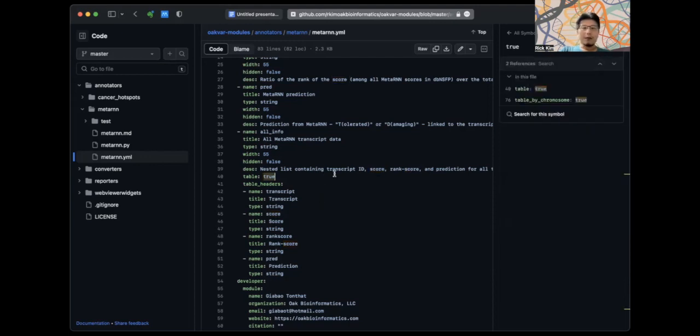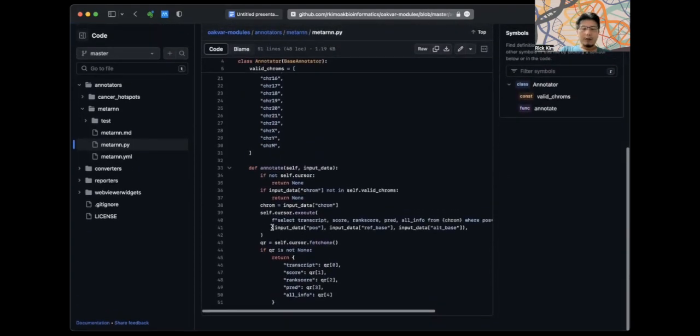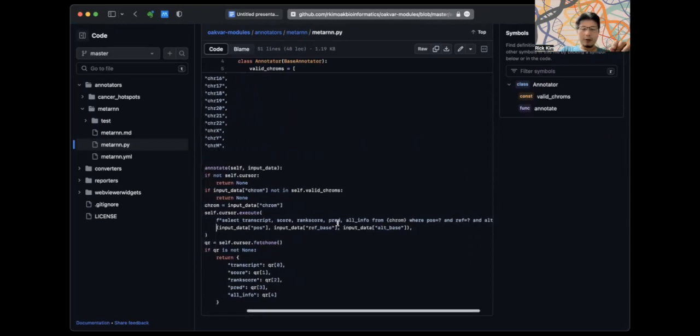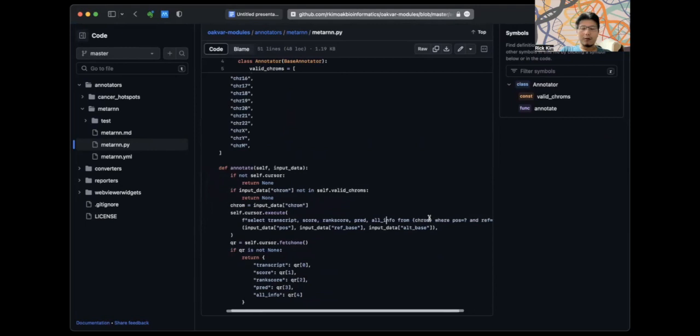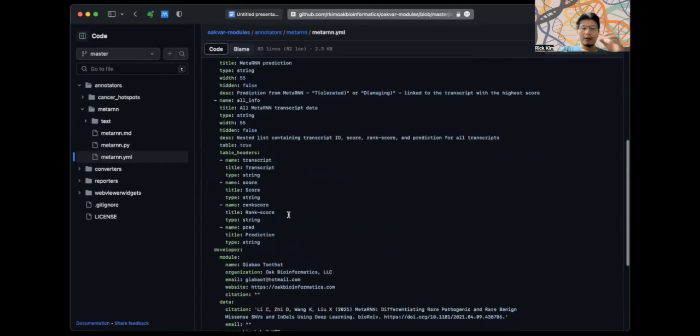But then if you do this, then in the Python file, you will have to create that data structure. And so here, that data structure is already stored in the database as a string, I guess. So then this Python script didn't do that JSON operation. But if not, then you will do that and then return it. Well, actually, no, sorry. You don't have to do it because OakVar does it automatically.